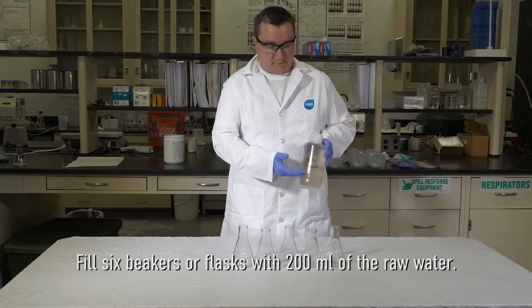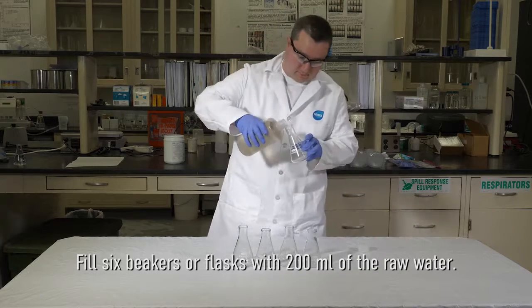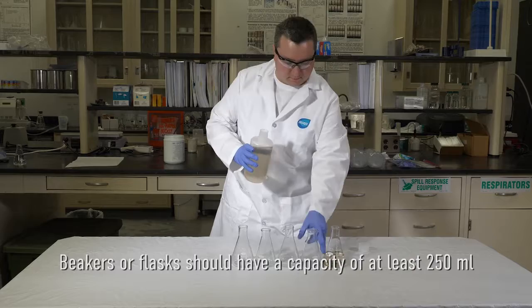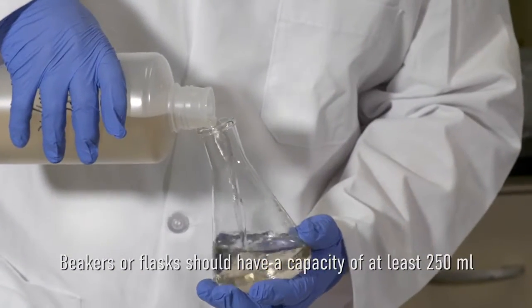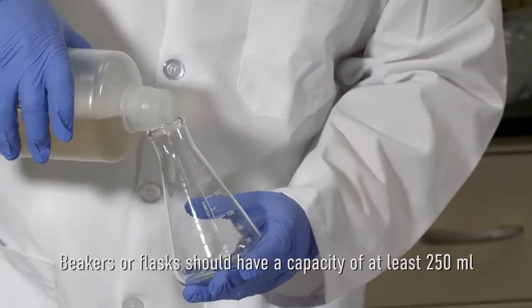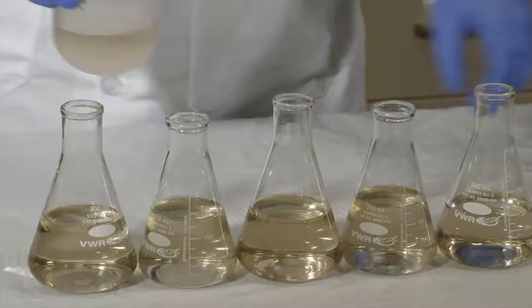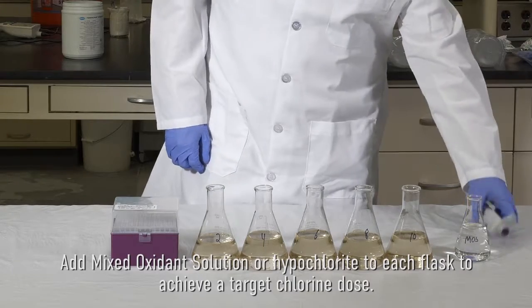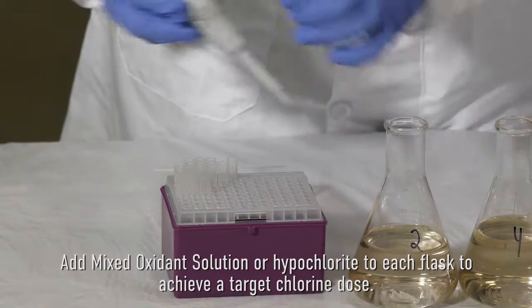Fill 6 beakers or flasks with 200 milliliters of raw water. Beakers or flasks should have a capacity of at least 250 milliliters. Add mixed oxidant solution or hypochlorite to each flask to achieve a target chlorine dose.